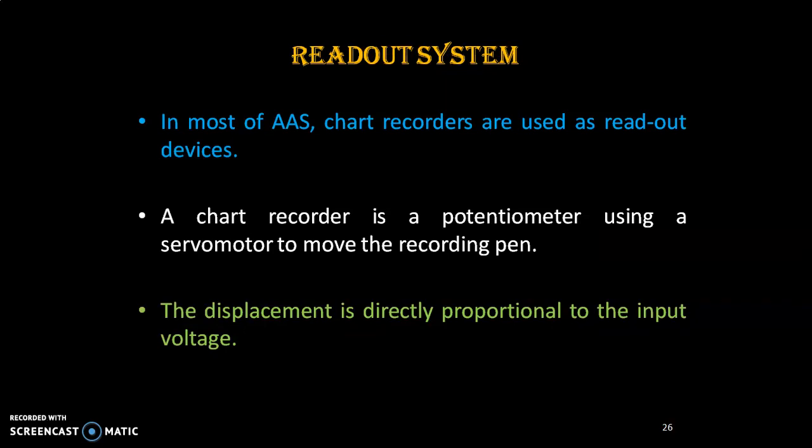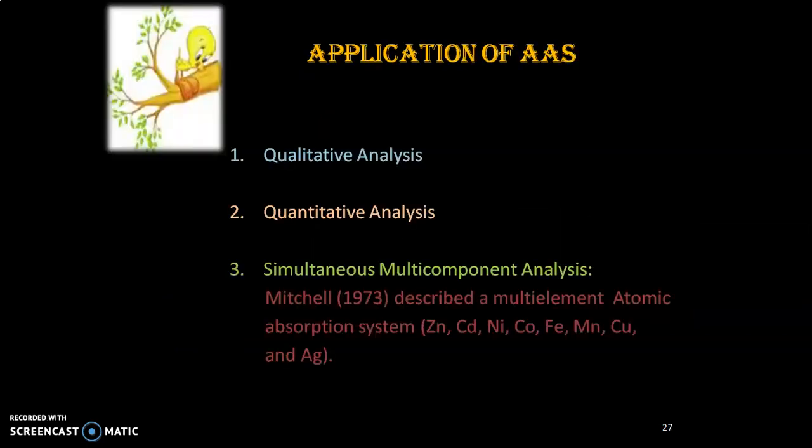The readout system is generally a potentiometer or pen recorder. Nowadays we have a computer screen to record the result.